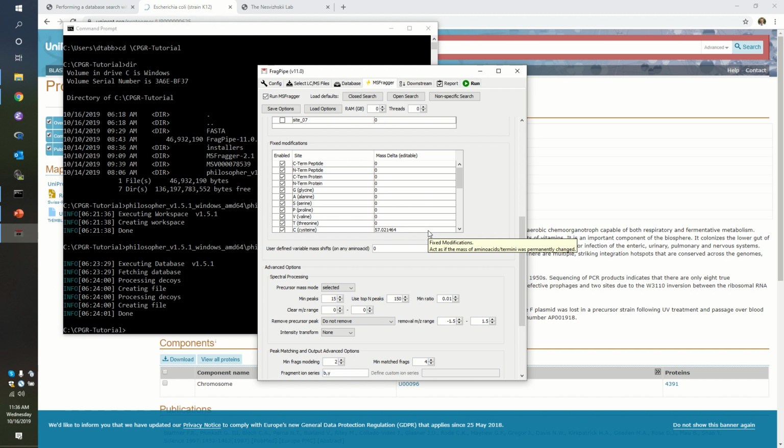Maybe the alkylation and reduction. Very nice, alkylation and reduction. Great. Yes, so you probably used dithiothreitol to break disulfides. Then you treated the mix with iodoacetamide. Iodoacetamide adds this alkylation, a carbamidomethylation specifically, to the side chain of cysteine. That is a mass change of 57. So every time the software encounters a cysteine in the search, instead of treating it as 103 Daltons, it's going to treat it as 160 Daltons, a 57 mass unit change.